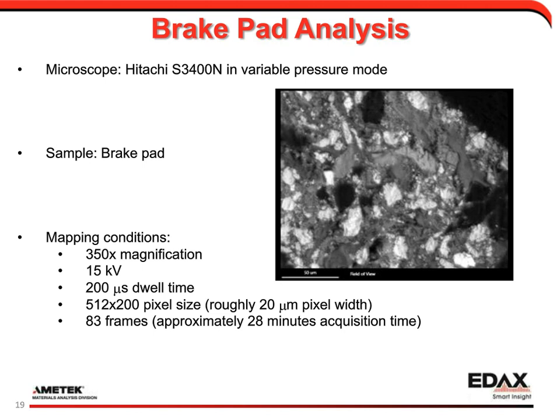It is not a huge problem though, because you can figure out how much this affects it by changing your pressure slightly. The effect of the beam skirting is fairly linear. So if you double or halve your pressure in the chamber, you should be able to see how much it affects the spectrum. In the next iteration of the TEAM software, we'll probably include an option to measure two spectra at different pressures and then extrapolate from that what the effect is and calculate back to what your spectrum would be if you didn't have the variable pressure mode.